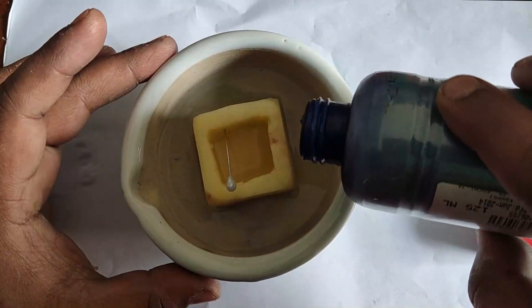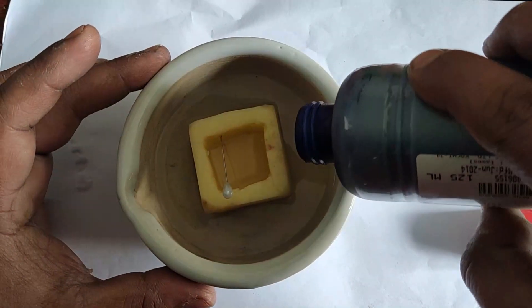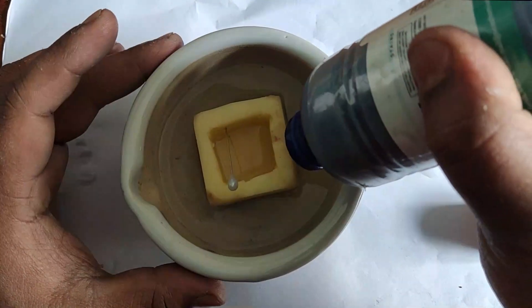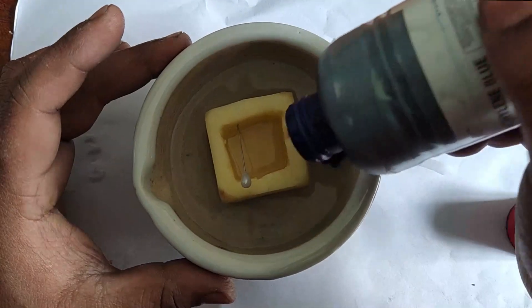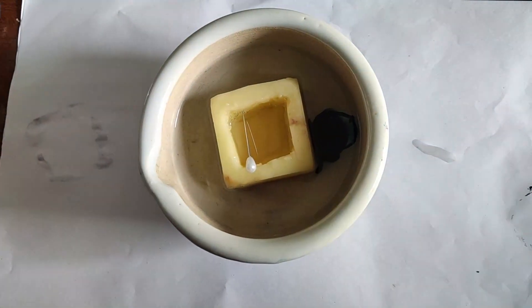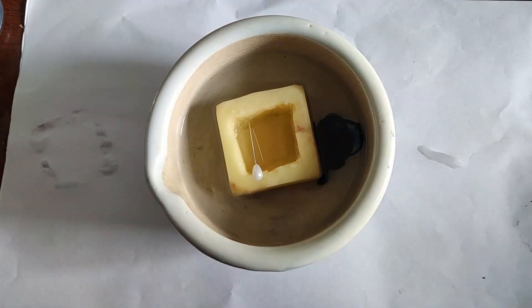To understand the phenomenon of osmosis more clearly, I will add a little blue color solution to the hypotonic solution. It will help us visualize the movement of water molecules from outside the potato cavity to inside the potato cavity.